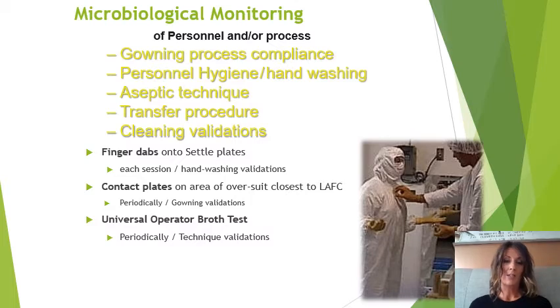Our finger dabs are taken by gently pressing the surface of our gloves onto an exposed agar plate. This is the same for a hand wash validation. You perform the same thing. There are many interpretations of how you perform a hand wash validation. You essentially are demonstrating that an operator can go from having contaminated hands to non-contaminated hands via the correct techniques of hand washing and gloving, etc.